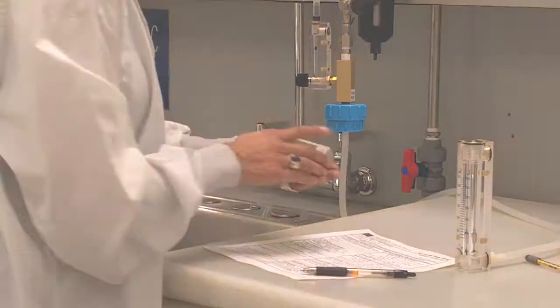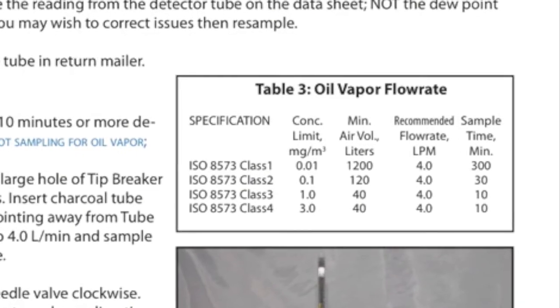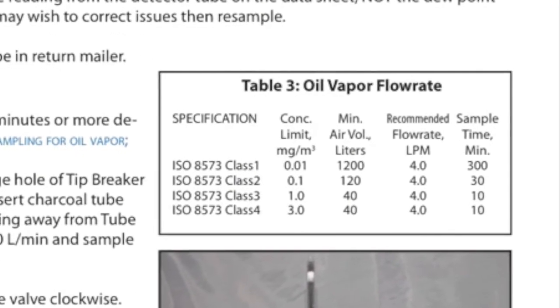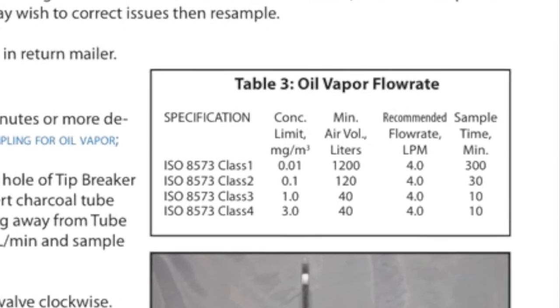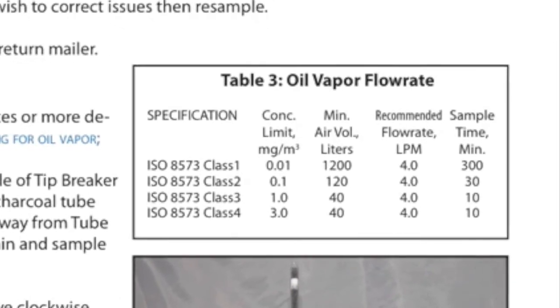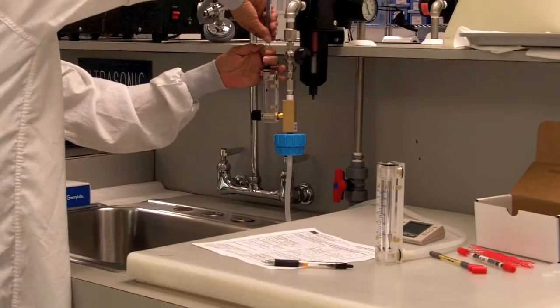Adjust the flow rate to 4 liters per minute and begin the third timer. Depending on the purity class you have selected, this test will take either 10, 30, or 300 minutes.